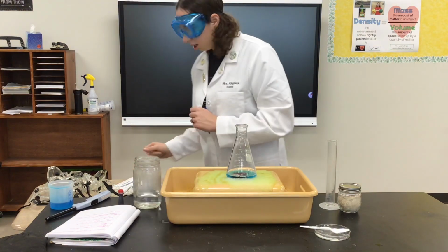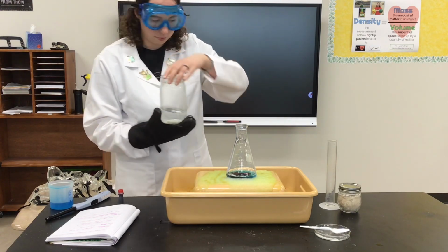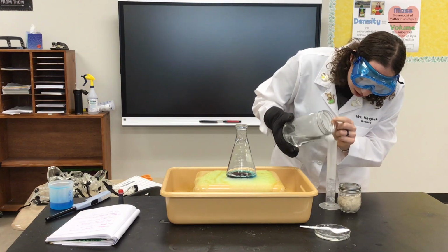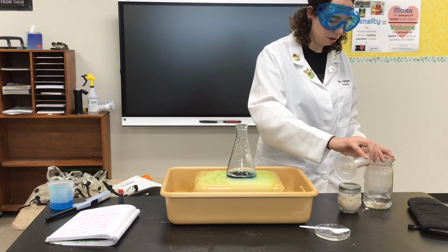It's actually a little bit warm, so I'm gonna use this. 20 milliliters of warm water. Again, I'm using distilled water to ensure that I don't have any minerals in my water.